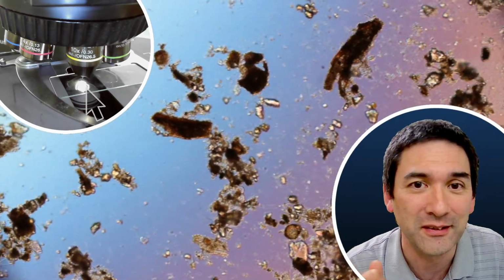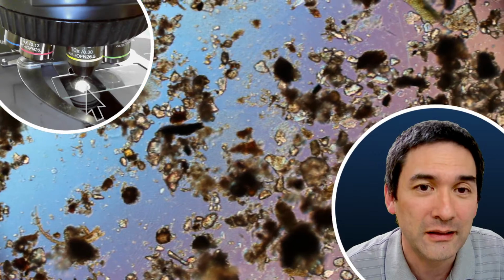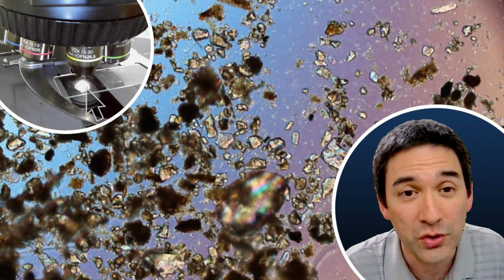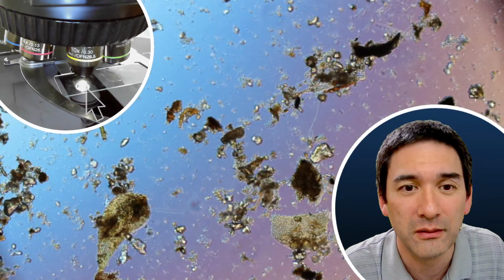It's really surprising, right? I said, wow, there are plenty of them in the moss sample. And in the meantime, I can't find any, and I'm wondering if they have moved away in a certain direction, maybe towards or away from light, or deeper down into the moss. That would also be a possibility.